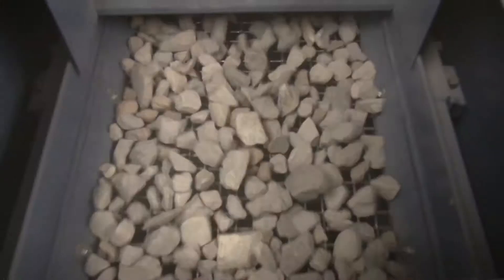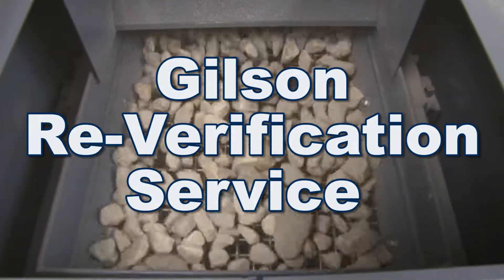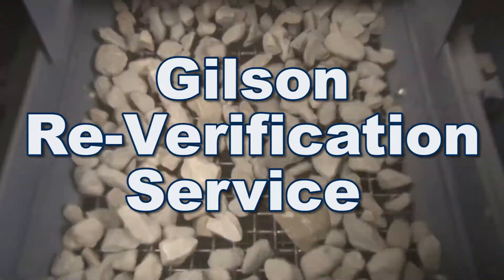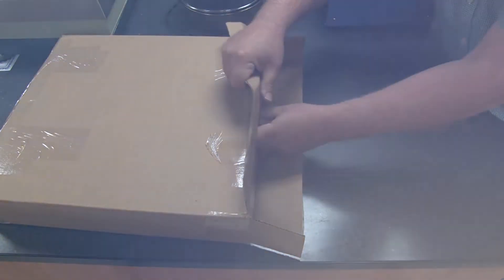For continued peak performance, periodic Gilson re-verification service will assure that your existing operational screen trays continue their compliance with ASTM and ISO standards. To order Gilson's re-verification service, simply contact your Gilson customer service representative on how to package and ship your existing operational screen trays.